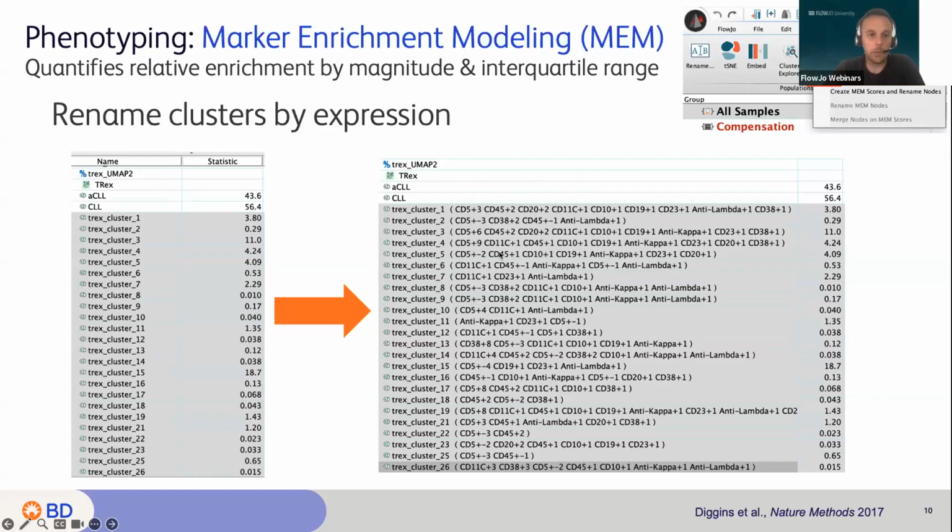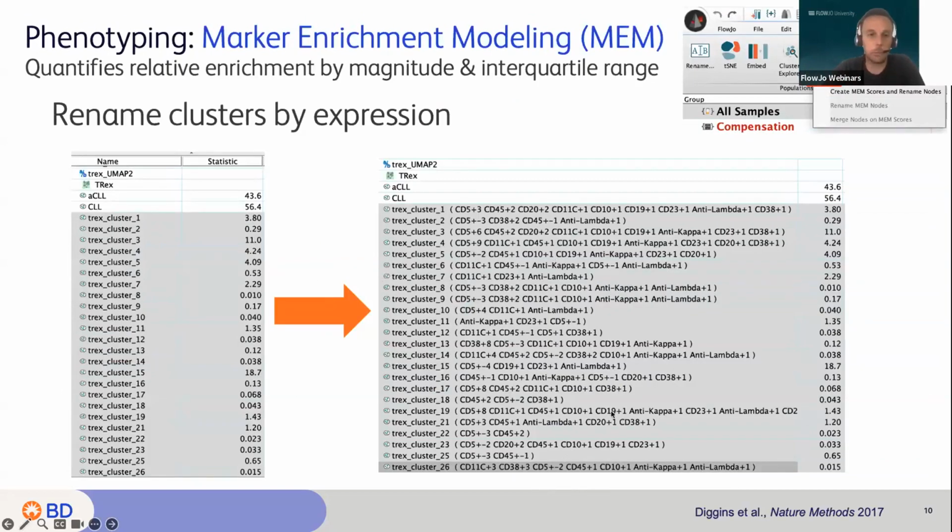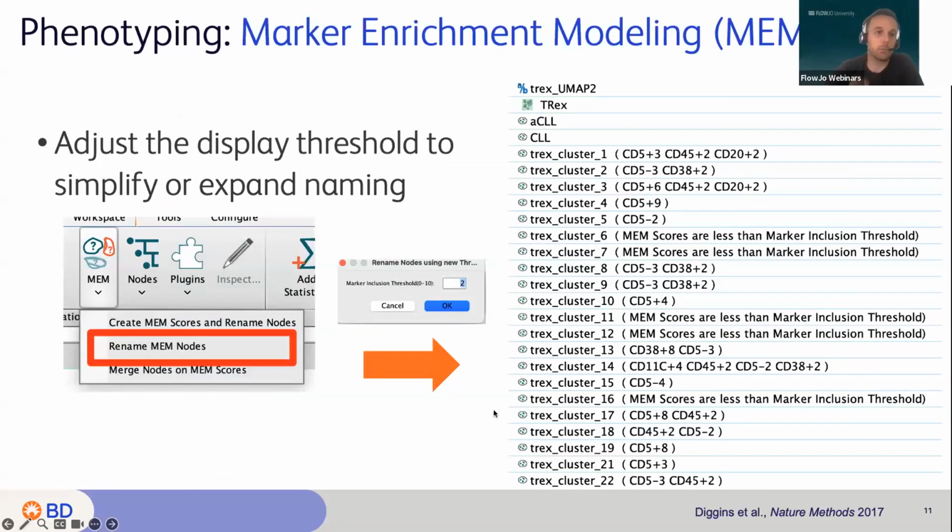And because we have those labels, if we think this list is way too big for us, that's way too many markers and a lot of markers that are not relevant, I can just put a threshold on those labels and say, instead of a threshold of a vector of 1 of positivity, I want a vector of 2, 3, 4, 5, all the way to 10, and really shrink my list of markers that are positive.